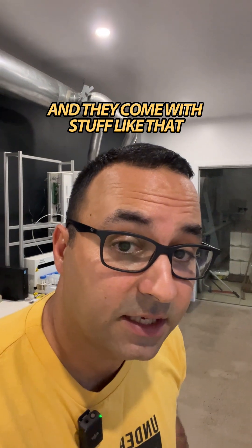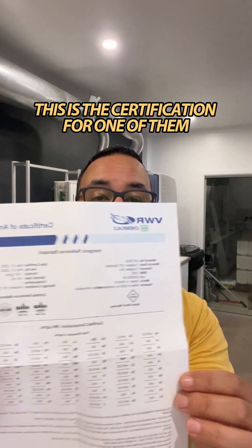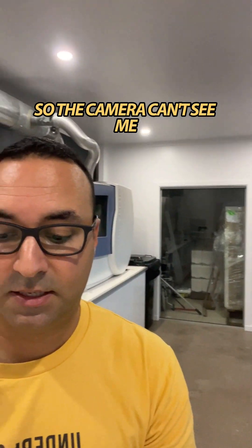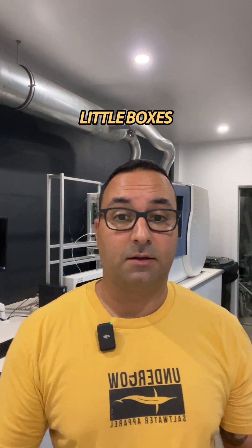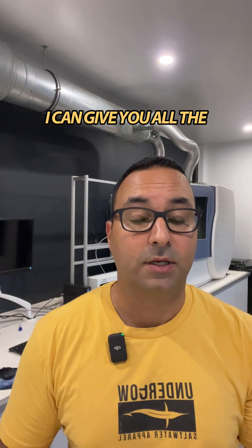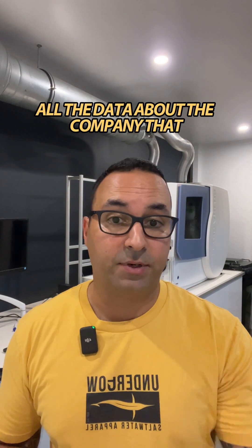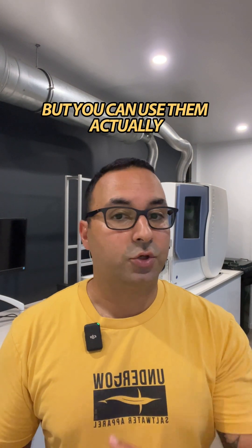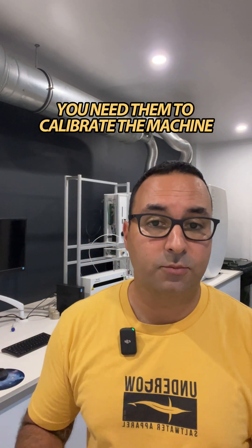They come with certification documents like this — here's the certification for one of them. They come in these little boxes and you use them to make a standard for seawater, either in a single or mixed version. We also have a big mixed version that we have a large company produce. I can give you all the data about the company that produced them — they're all high lab-grade companies. One of these standards costs us around 500 euros, but you can use them quite often and you need them to calibrate and check the machine.